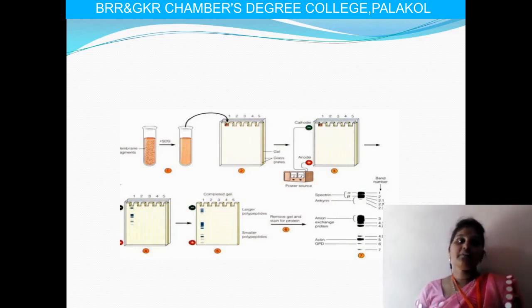Glycine buffer is present in the upper reservoir. It is present in two forms, as a Zwitter ion and the glycinate anion. After the gel sample is loaded, the power is switched on, and the chloride ions and glycinate ions start moving to the anode. After entering the stacking gel, the glycinate ions, at low pH, are converted into the Zwitter ion state.